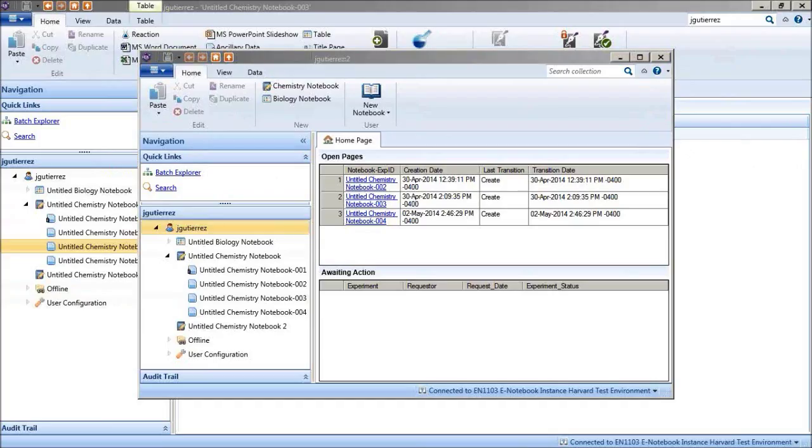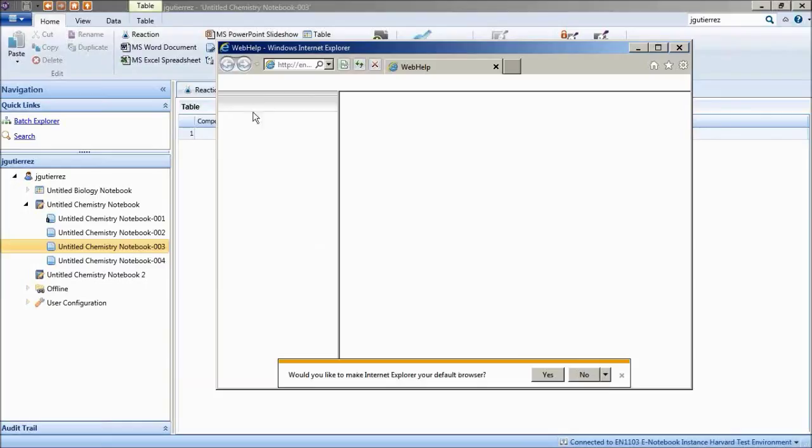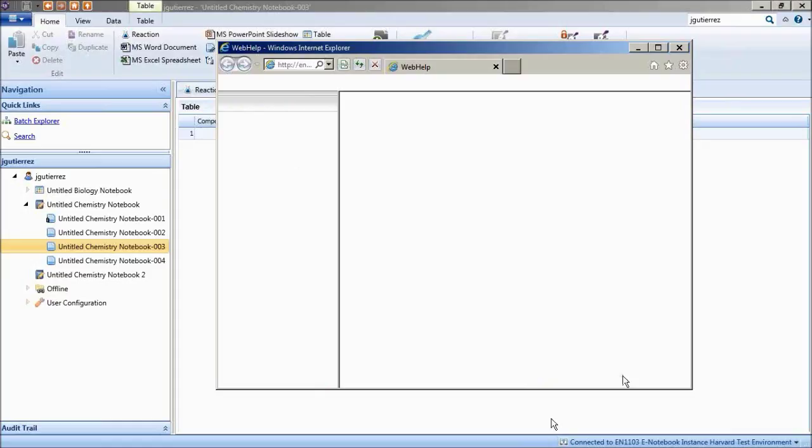And to finish with this quick overview, you see that there is a question mark over here. You have access to the notebook help that will open a new window in Citrix. Right now my profile doesn't have it as an authorized site to visit. I will need to work with Citrix for this.